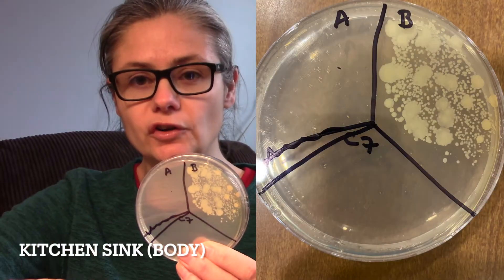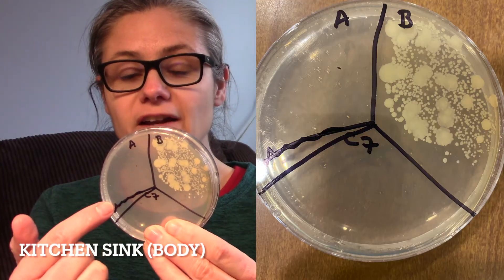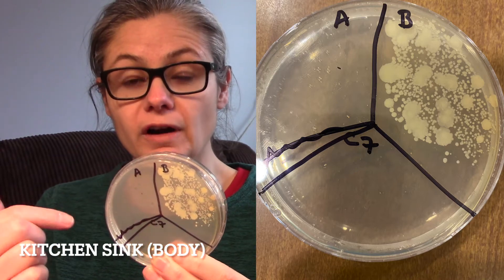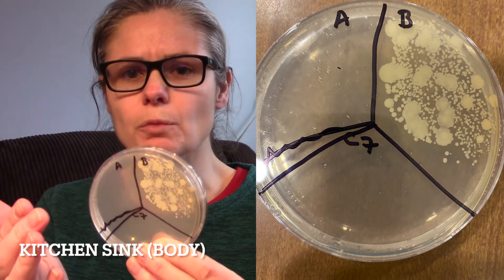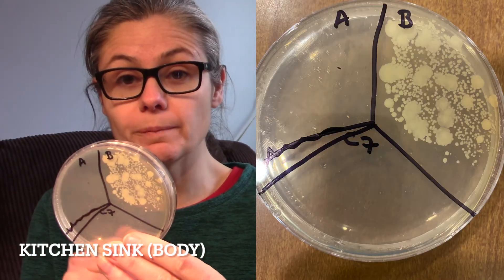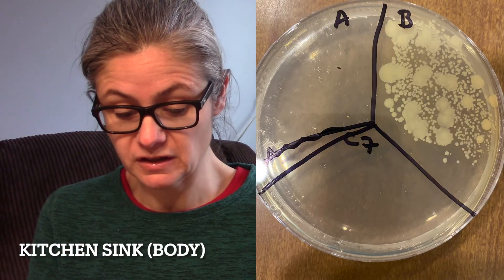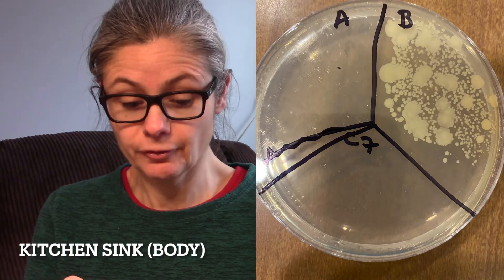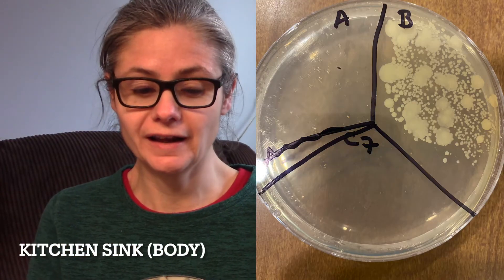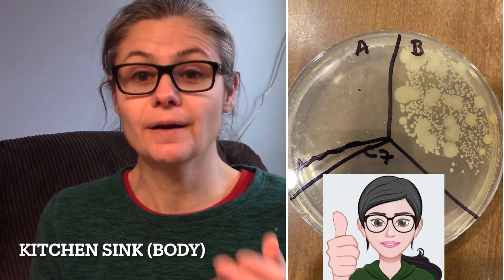The kitchen sink, the sink portion — not the strainer. I do have a little squiggly line here because when I was drawing divider marks, I made section A too small, so I squiggled out and made a bigger spot. In B for before, lots of different bacteria — different sizes, different shapes, a good sampling. And in A for after, nothing. Not one bacterial colony. So I would say Dr. Bronner's is extremely efficient at disinfecting my kitchen sink.